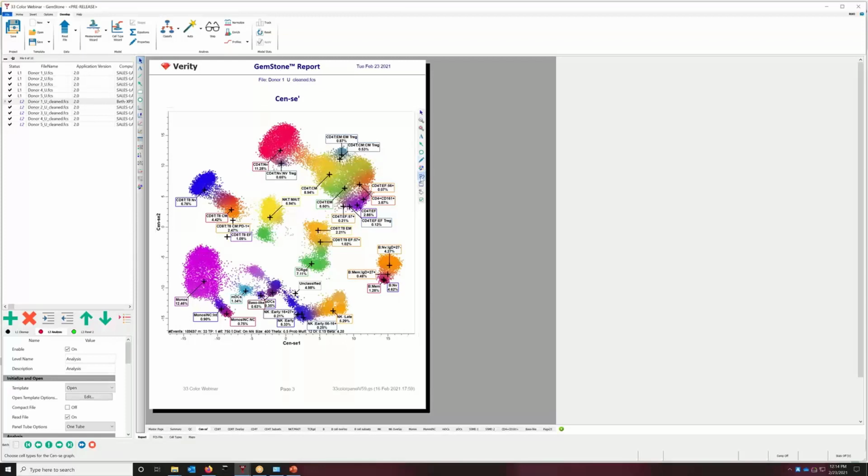And I want to show you a little bit more about this unknown population. So I'm going to just draw an arrow, and this is the population that I'm interested in. It's not labeled. It's part of maybe the unclassified or unassigned population, but it's similar to our MDCs, our PDCs, our monos over here in the bottom left. Going to draw a region around this. Come over to my region icon, draw a nice region around that, and then right-click and show my region animation.